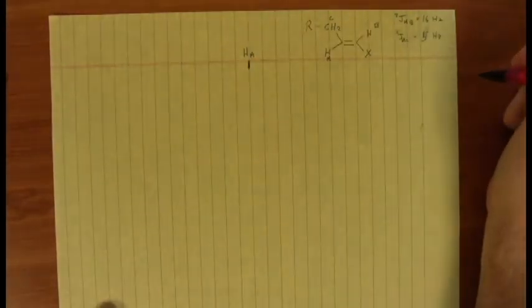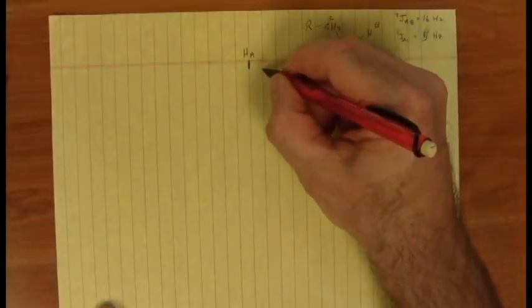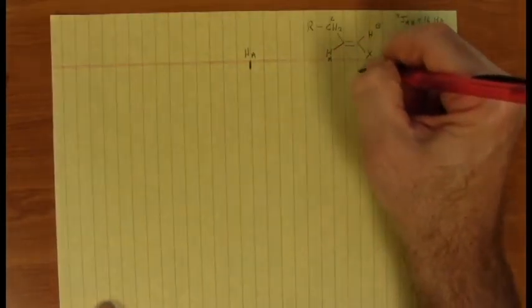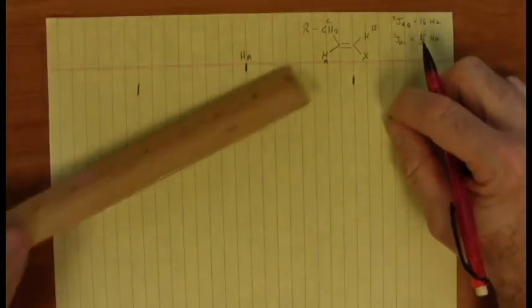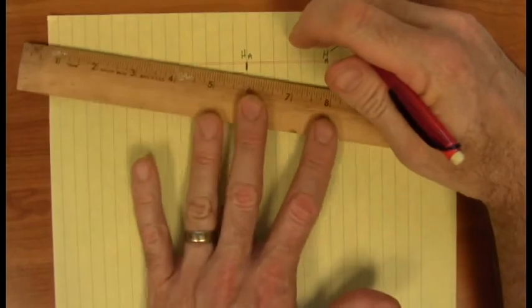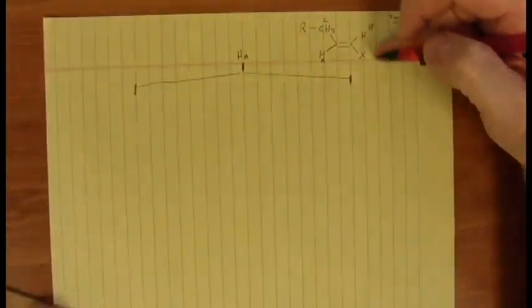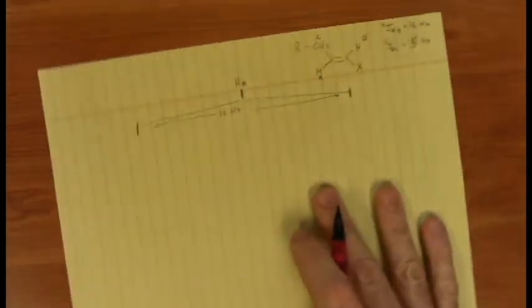So what we do is we, again, take the biggest coupling constant first, and that is going to be the doublet from hydrogen B, the 16 hertz doublet. As before, I have the center position here, the chemical shift of hydrogen A marked, and to make a doublet of 16 hertz, I go 1, 2, 3, 4, 5, 6, 7, 8. One branch will be there. 1, 2, 3, 4, 5, 6, 7, 8. The second branch will be here. Connect those up nice and pretty. There is the classic 16 hertz trans across a double bond coupling constant.